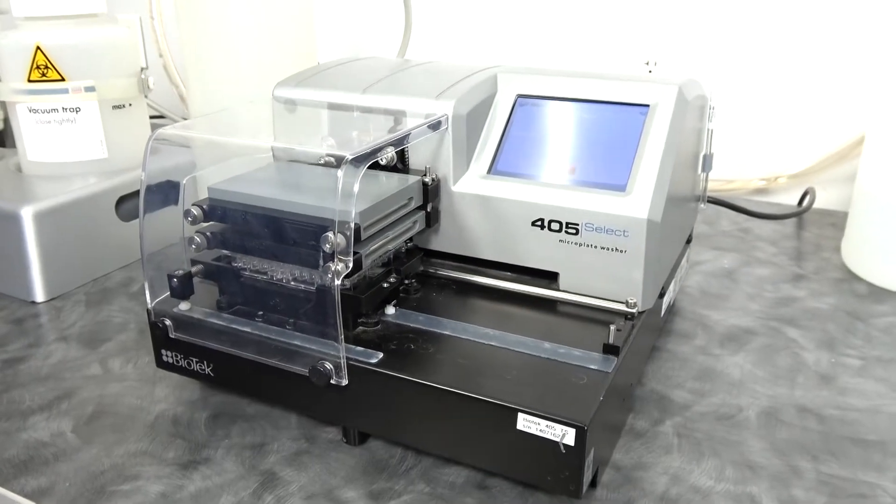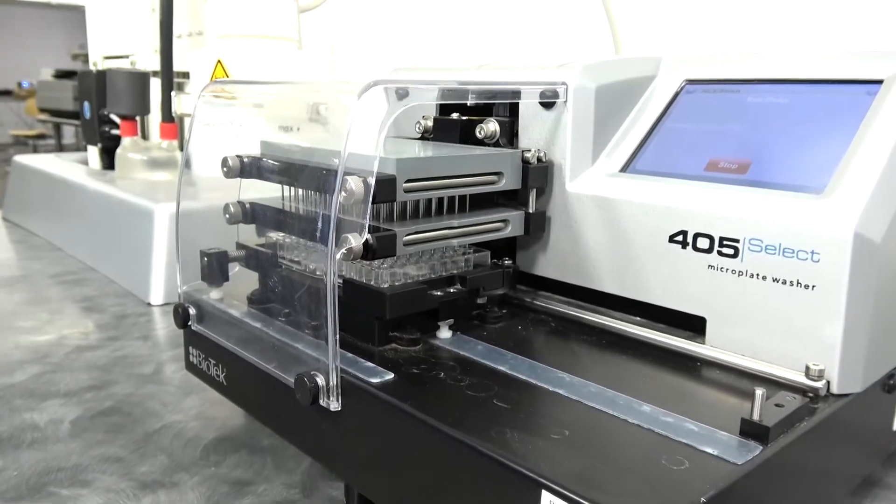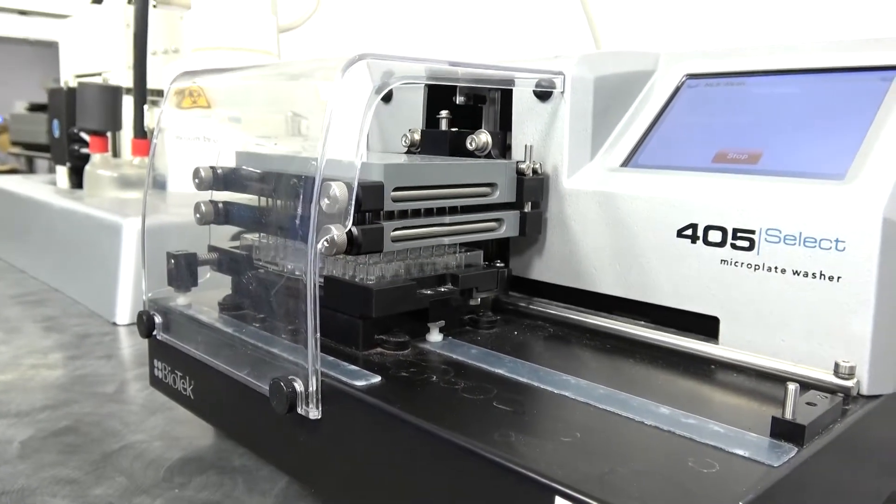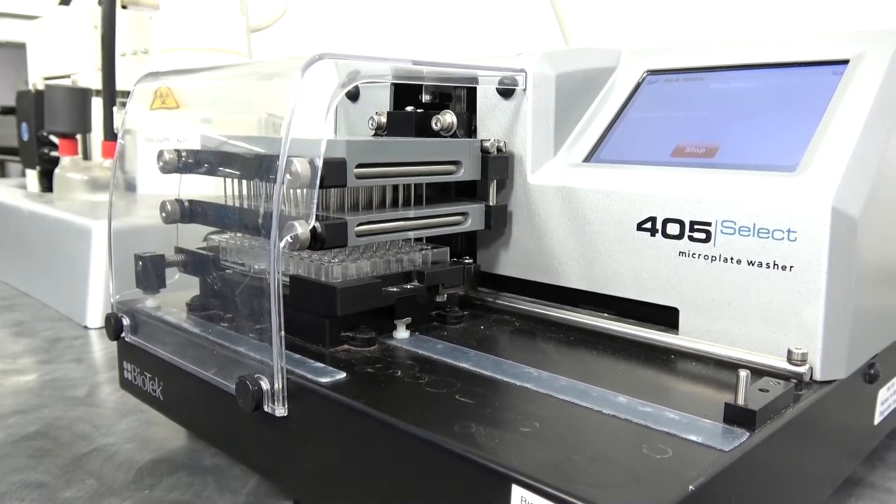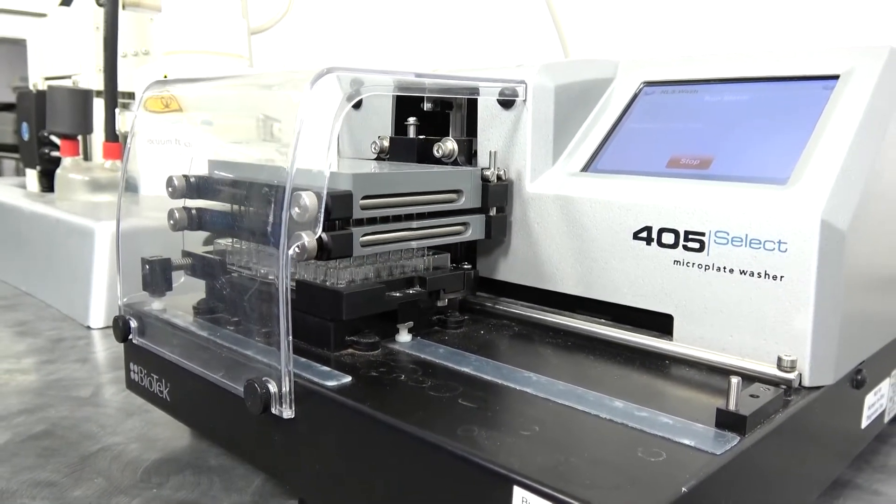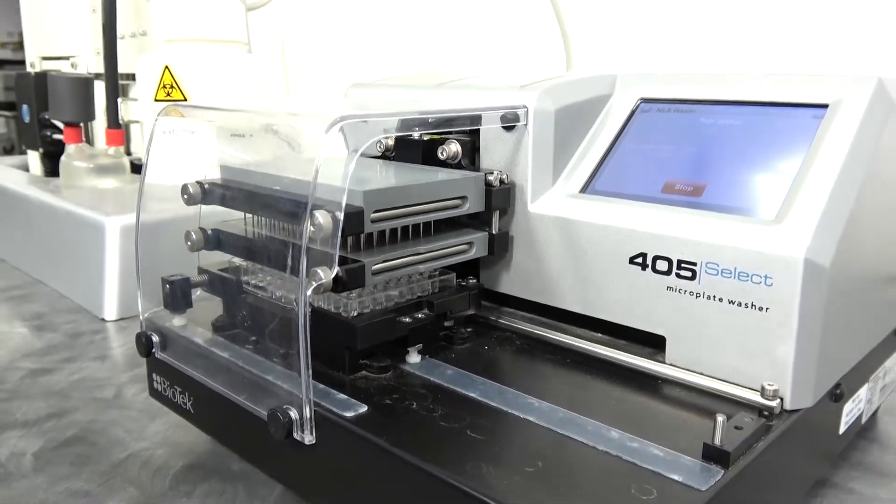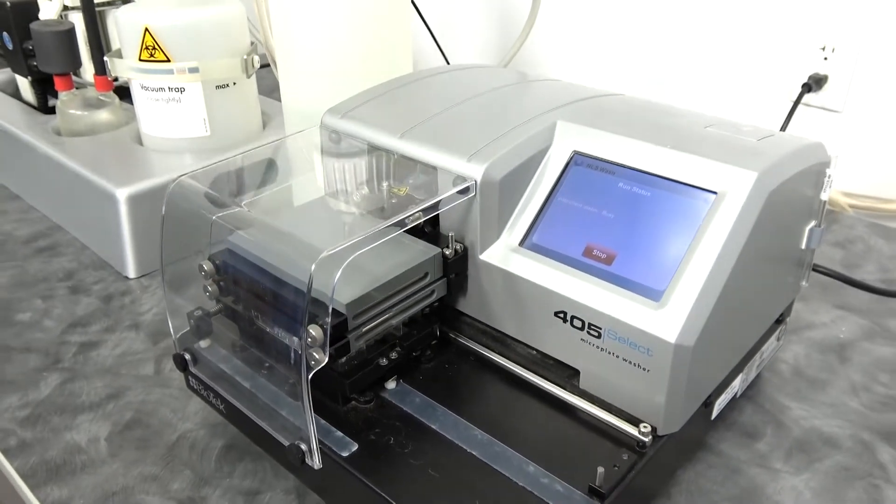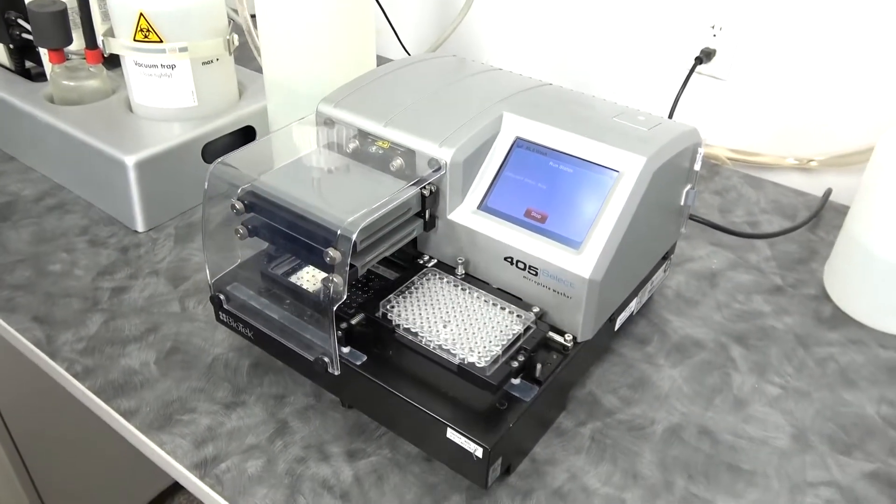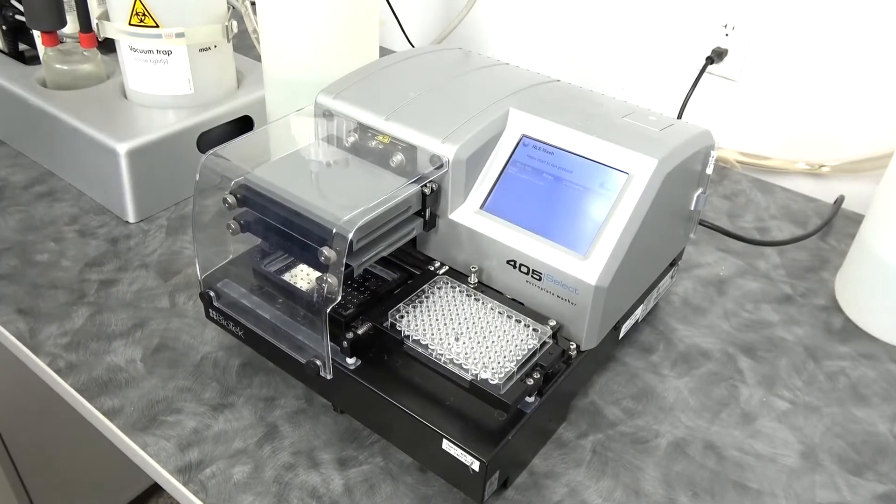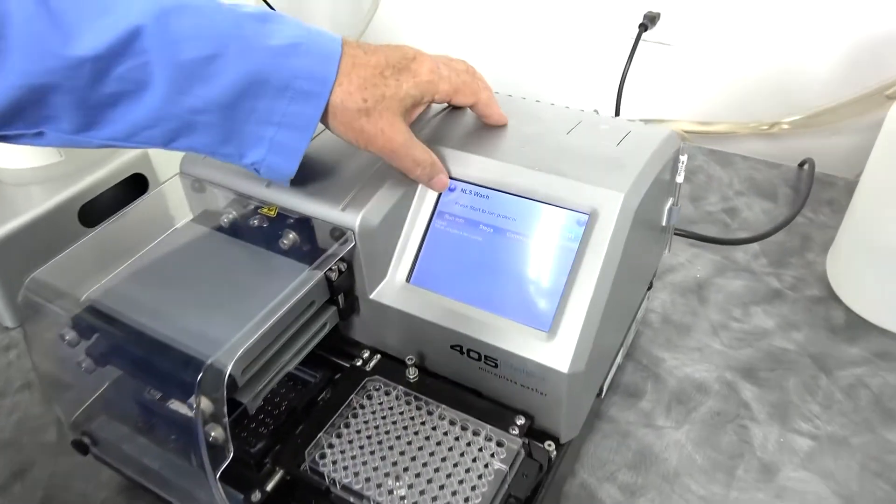And it has sonification to help you keep it working in tip-top condition. We've got it set to program three cycles, and that's one of the things that's amazing about this unit. The programmability of this unit is remarkable. Of course, you'll see it's very fast because it's got the 96 heads on it, but very easy to program.